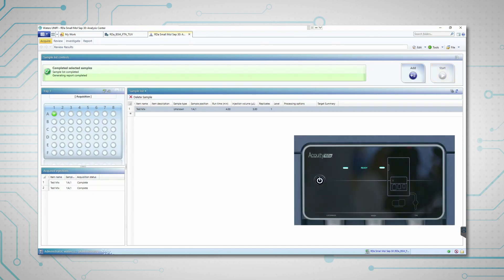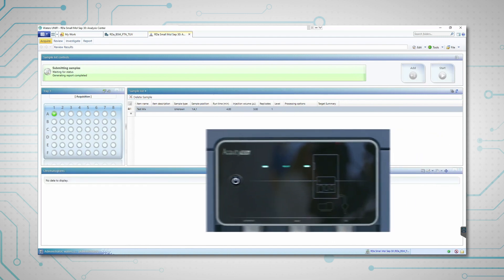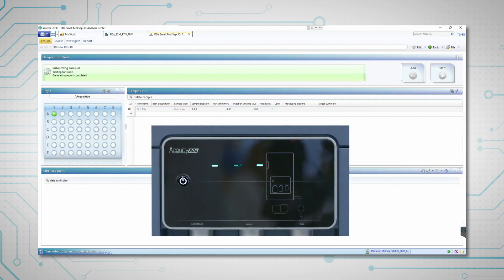The information panel on the front of the RDA displays the status of the system in real-time, changing from ready to running as the injection begins.